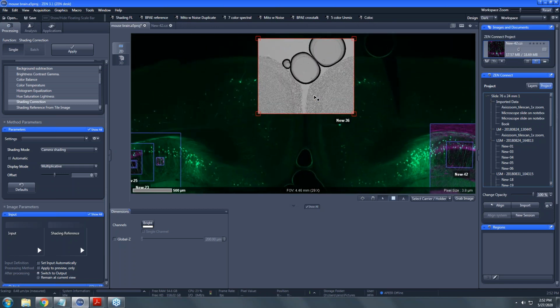I should say if you're using it on a scope, there is a paid version of it that you can then use Connect to navigate. So you could navigate via this preview image. And that's something that does cost more. But for the images to show up and build this kind of image database is something that there's no cost associated with.